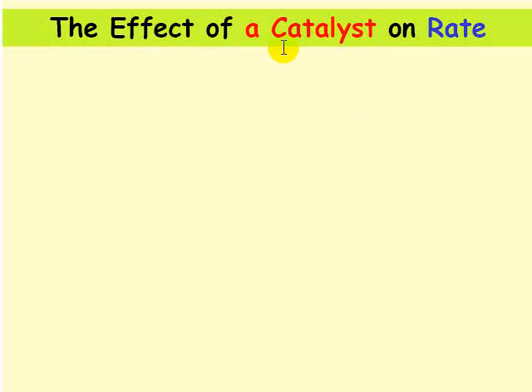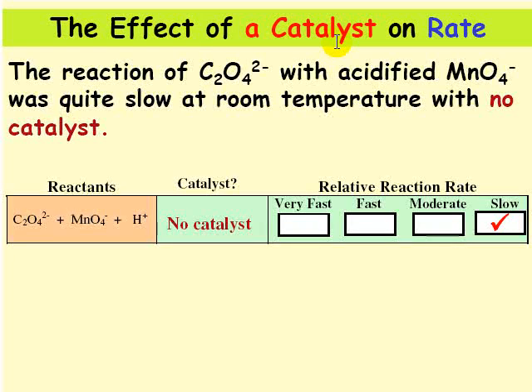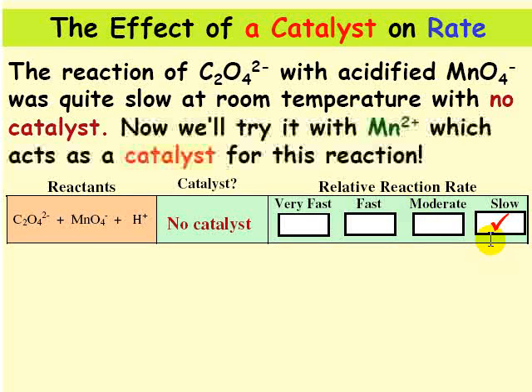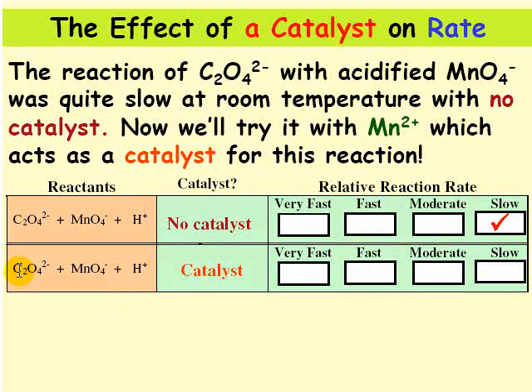Now we're going to look at the effect of a catalyst on the reaction rate. As you recall, the reaction of C2O4^2- with acidified permanganate was really slow at room temperature when we didn't have a catalyst. Now we're going to add a catalyst. Mn2+ works as a catalyst for this reaction. So we're going to do the same reaction this time with the catalyst and see what happens.